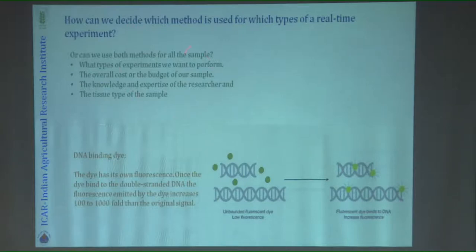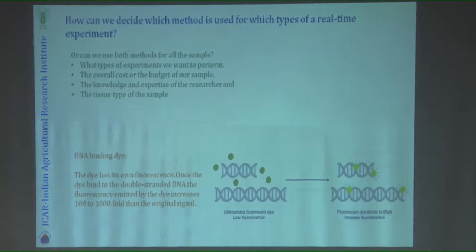Which method to use depends on the kind of experiments you want to perform, the cost of doing that experiment, and the knowledge and expertise of the researcher. What do you understand about the method? How would you like to interpret your results? Those also should be known. And the type of material which you want to use for your whole analysis.